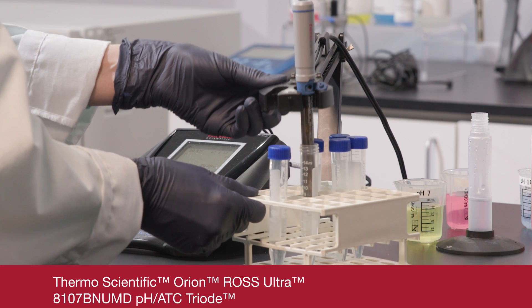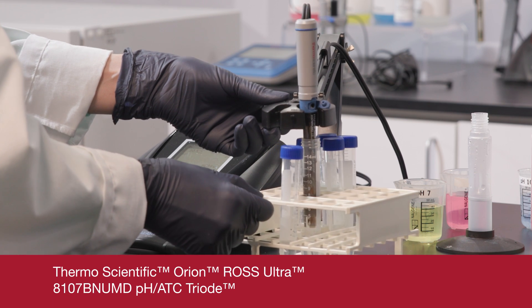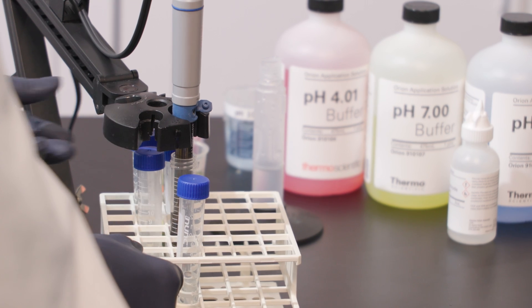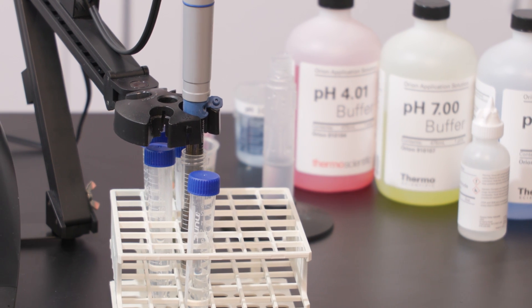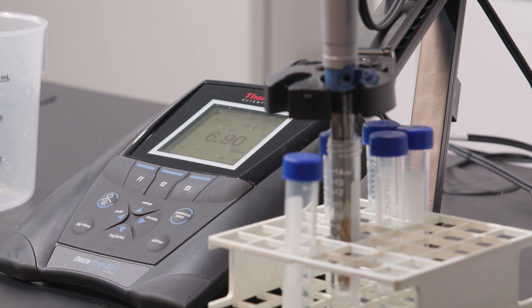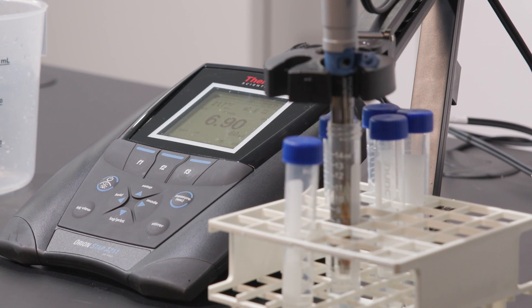Temperature is critical to your pH measurements, so it's important to know your sample temperature as accurately as possible. Temperature can be measured using a triode, where a temperature sensor is incorporated into the electrode, or with a separate temperature probe. Triode electrodes are a great choice because they take up less space in your sample vessel and provide accurate measurements without the need for a separate probe.